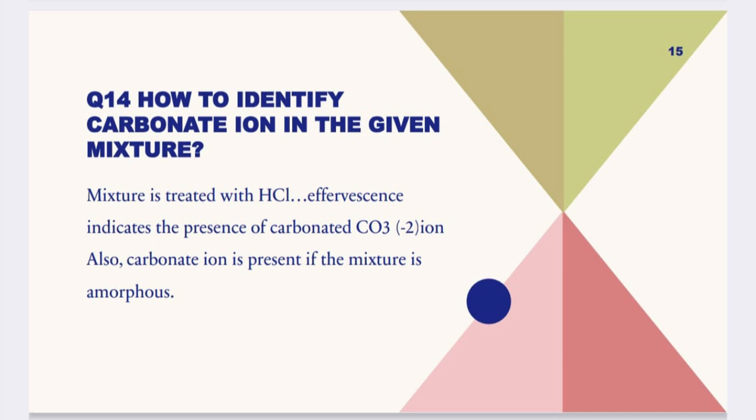But that doesn't mean, my dear friends, that all amorphous salts contain carbonate ions. Carbonate ions will be present only if the mixture is amorphous, but it's not necessary that all amorphous salts contain carbonate ions. I hope you understood this.